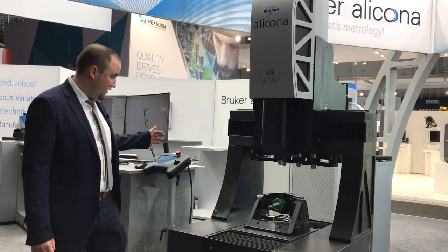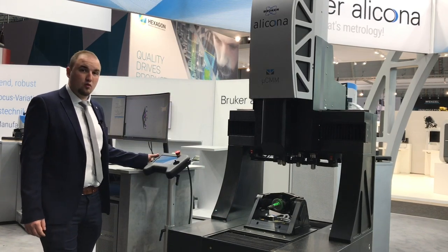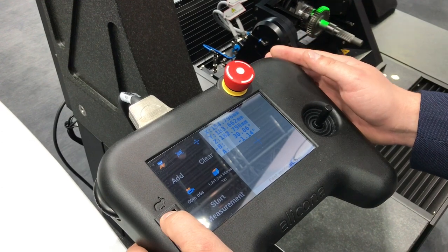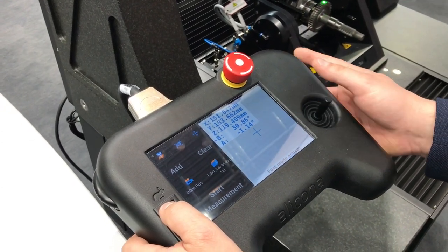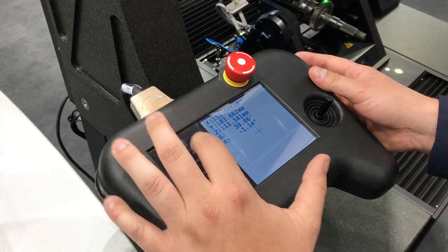The system is operated by an innovative controller. The integrated touchscreen and the intuitive control panel make the entire user guidance very simple.